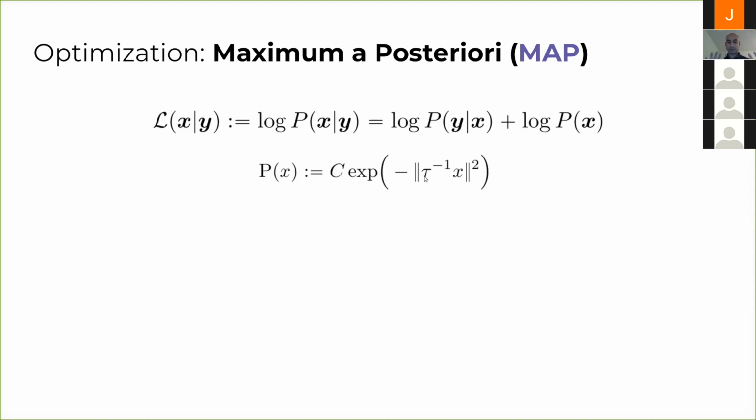If you're doing your reconstruction, in the final steps you split your data into two halves and reconstruct them separately. Then you can calculate the Fourier shell correlation between these two reconstructions to get some kind of confidence about how much you trust your data. If you have high correlation between your maps, that means you have a reconstruction that you have high confidence in, and what you can do is put more confidence into your data term, and you can reduce your prior assumptions. You don't have to make as many prior assumptions about your data.